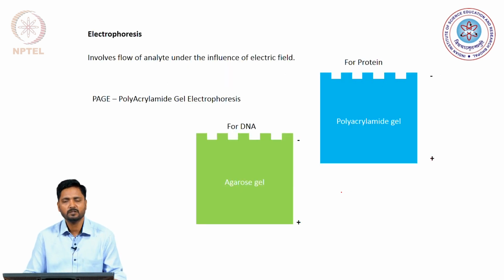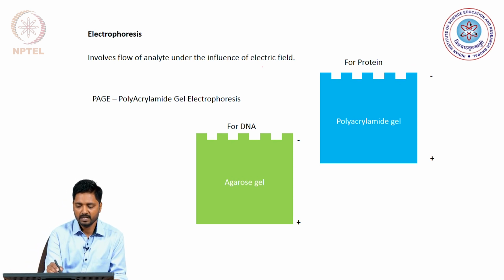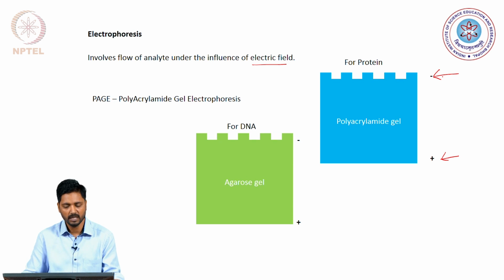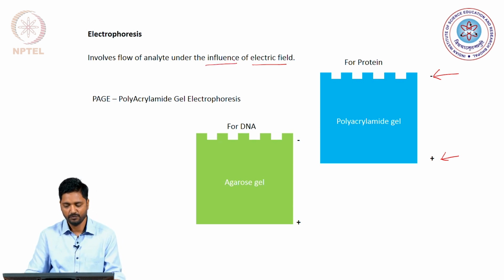So, electrophoresis is nothing but when we apply an electric field. For example, here we have applied an electric field and we move our analyte of interest under the influence of this electric field.